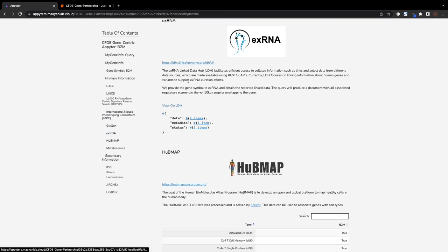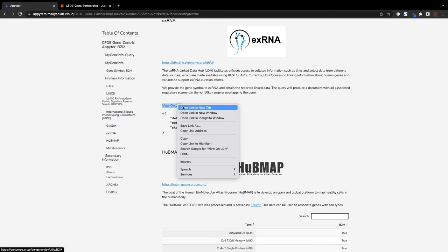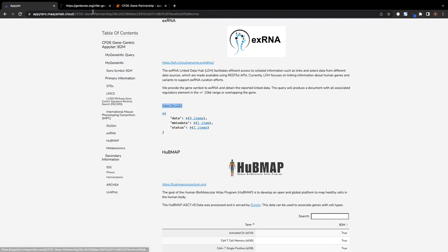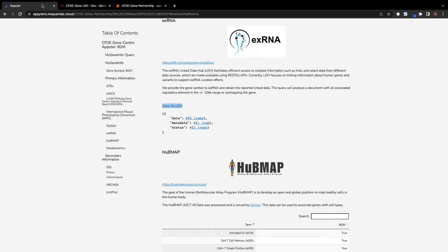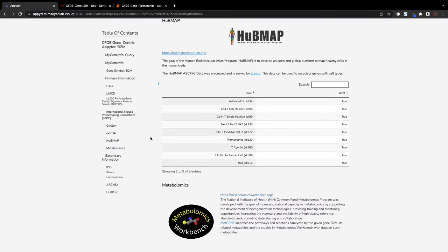Associated regulatory elements can be queried from the XRNA Linked Data Hub, which carries information on genetic variants. Associated cell types are extracted from HubMap, which is dedicated to mapping the human body at the single-cell level.